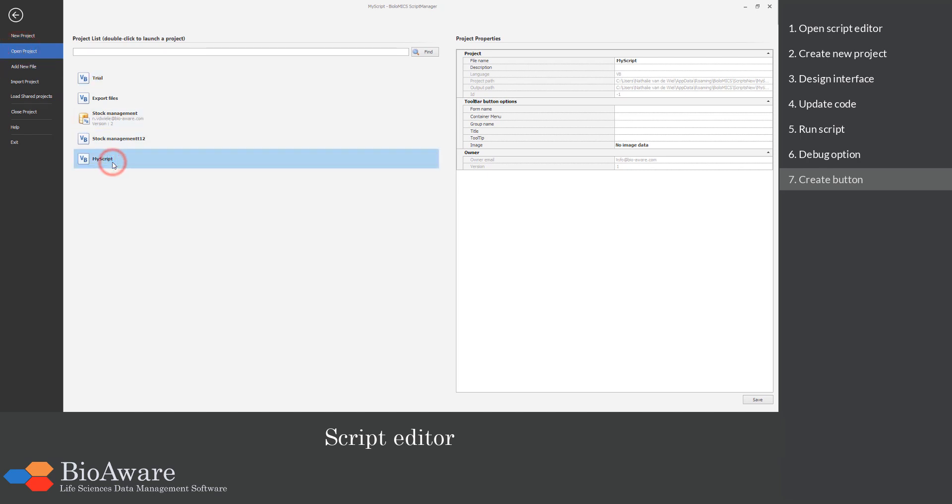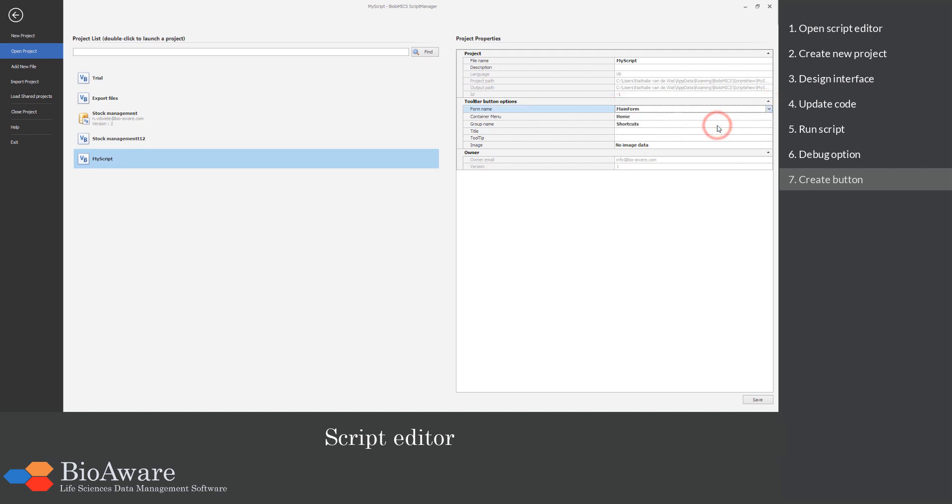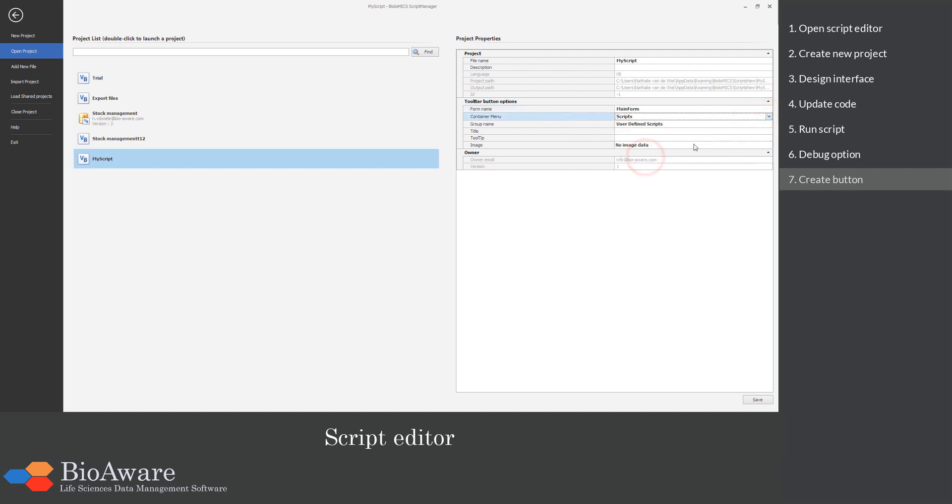Select your script from the list and update the project properties on the right. Decide where the button should be placed, give it a name and tooltip and choose a nice picture to recognize it easily.